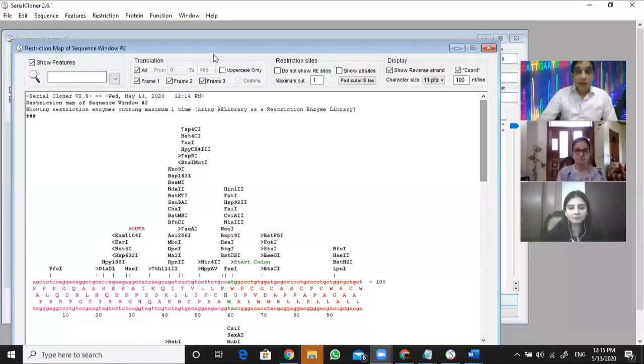No, sir. Sorry, I think I clicked at the wrong place. When I click on the sequence map, it takes me here. A lot of buttons are here, which can make a lot of confusion. And I can tell you, bioinformatics sometimes helps me a lot in understanding my molecular biology, because when you see the things, it gives you a different impression.